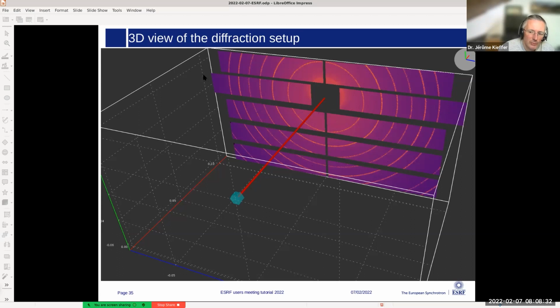this is one single piece of silicon, which is mounted on top of an ASIC, and the ASIC has specific markers that are validated with an optical metrology tool. So we have optical metrology. We have 3 control points per panel, as you say. And with this, we are able to calculate the position in space. And the calculation is done once for good, unless we unscrew. If you have optical metrology, there are no questions here.